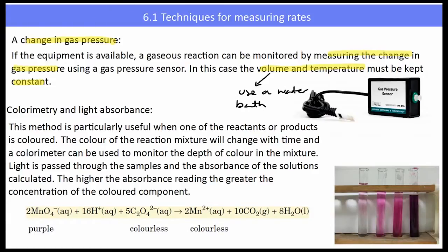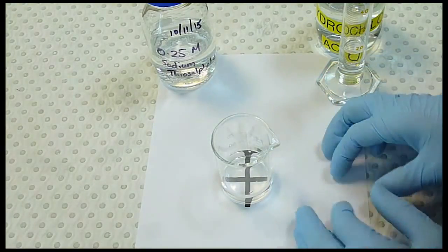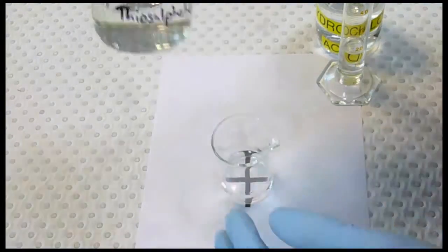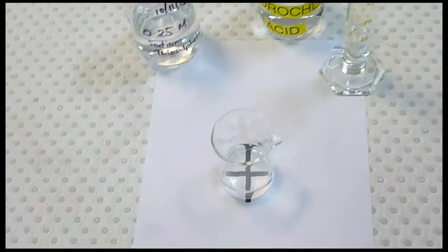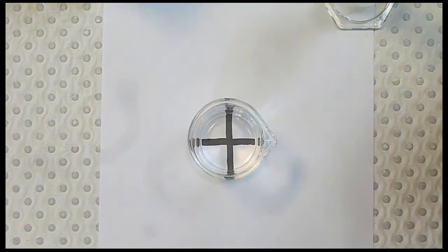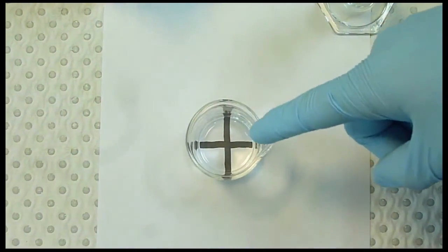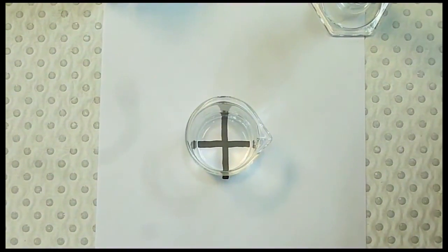An example of a colorimetry or light absorbance process is the reaction that is up now. The final reaction is where we would predetermine a point where we stop the reaction. This reaction takes place between sodium thiosulfate and hydrochloric acid. At the moment I have my sodium thiosulfate in my beaker. It's a colorless solution and I've drawn a black cross at the bottom. Now our predetermined point where this reaction is complete is when we can no longer see that black cross. As soon as I add the acid to the thiosulfate, we should get the reaction to occur. We will time the reaction to work out the reaction rate.